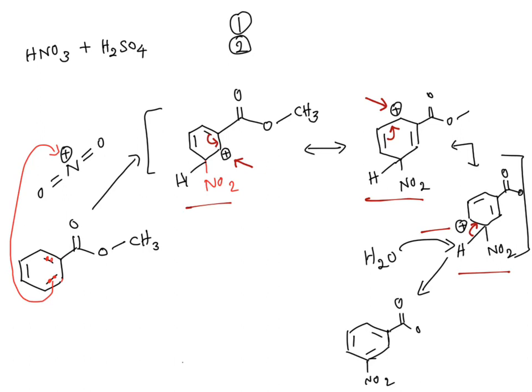The third question is, why do you mix the nitric acid and sulfuric acid slowly? I think I explained that in the lab demonstration video, that if you mix these two acids, it is an exothermic reaction. Right?